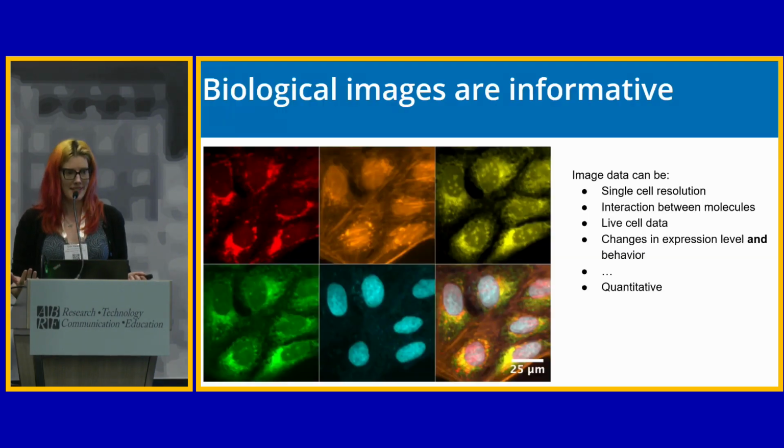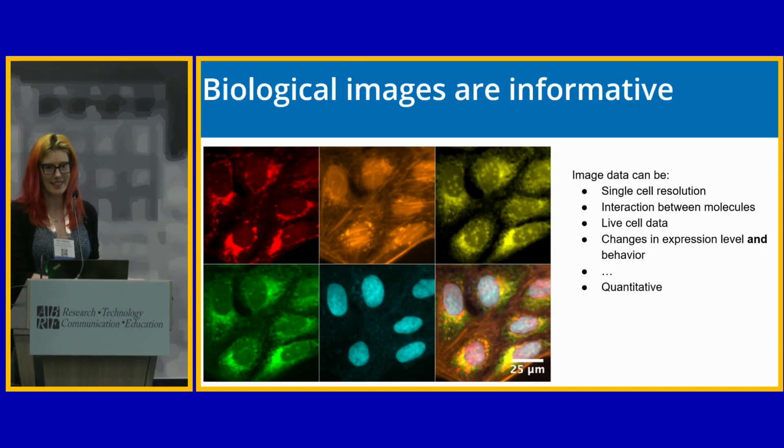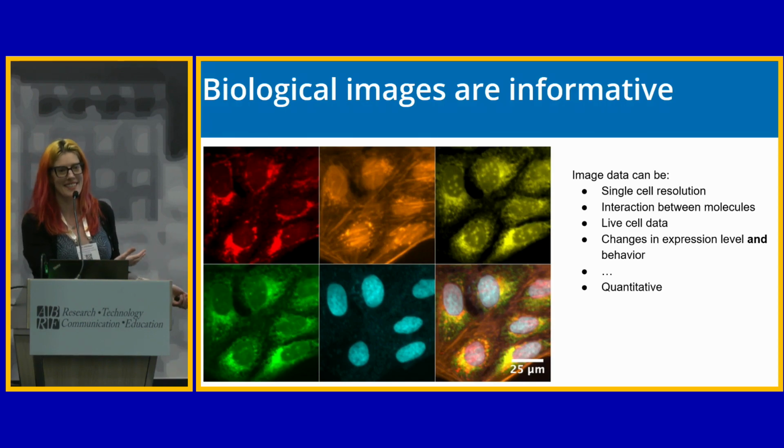Okay, why images? Well, they're really informative. First of all, they're pretty, right? It's a lot of fun to stare at these all day long. So pictures are pretty, but more than that, they can be so much more. Image data can be single cell resolution. It can show you interaction between molecules. It can show you live cell information. It can show you changes in expression level. It can show you changes in behavior. And beyond all of that, biological images can be quantitative.